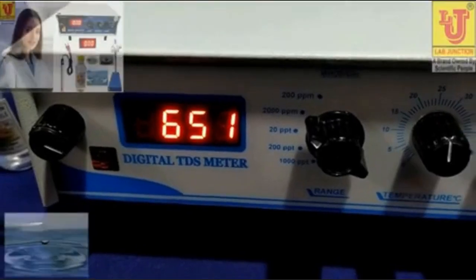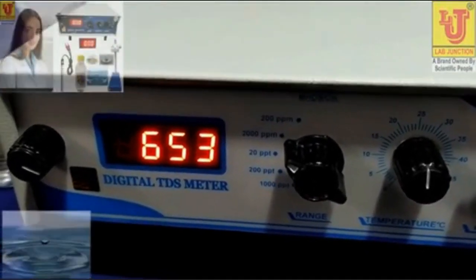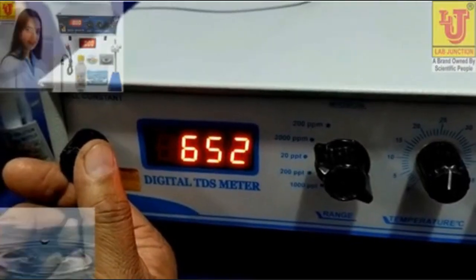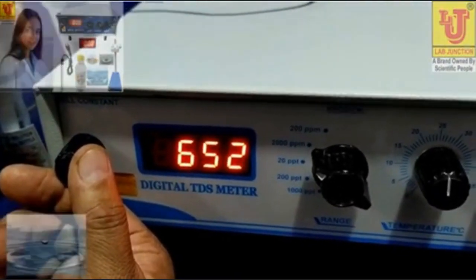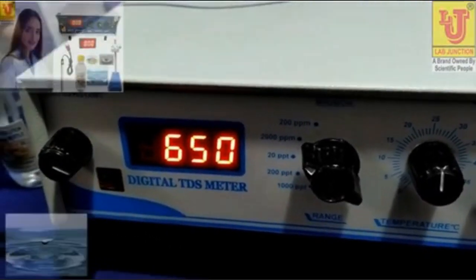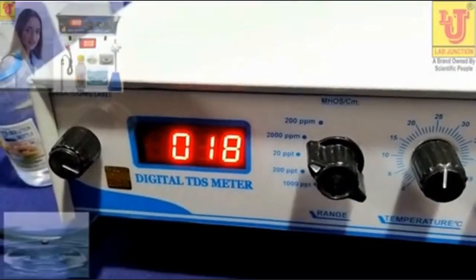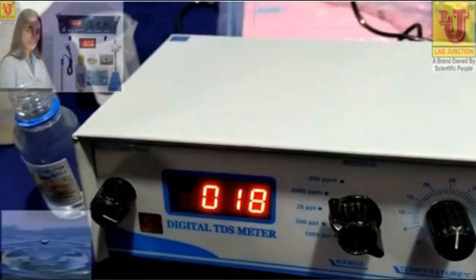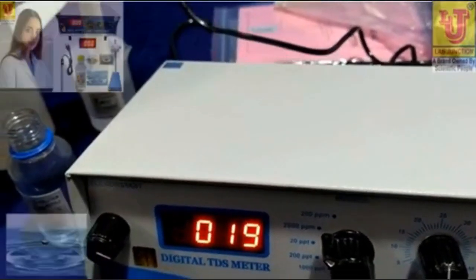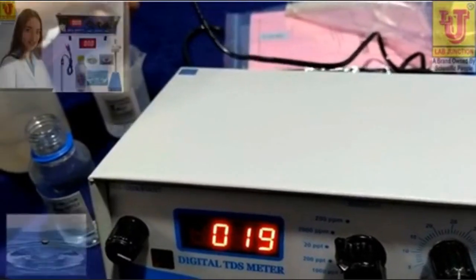Now your standard solution value is fed in the instrument, 650. Now this is standardized. Now refresh your solution with distilled water and take the readings.